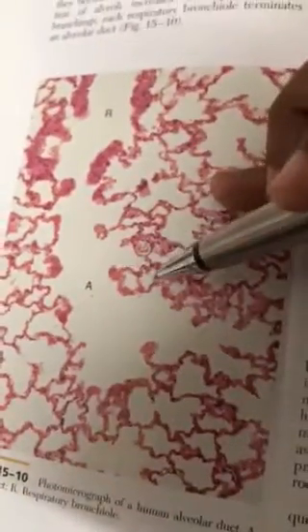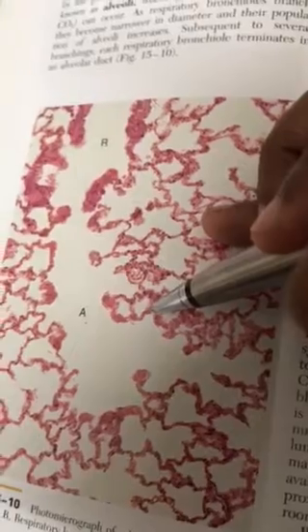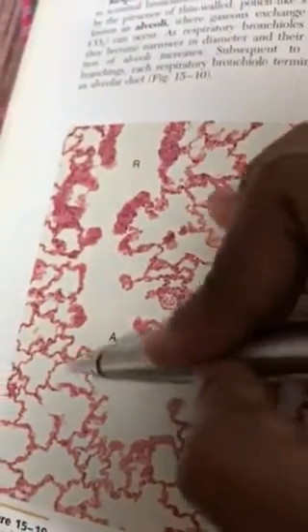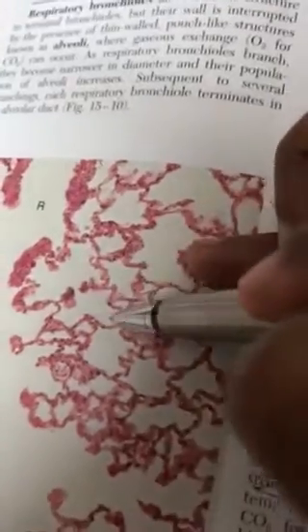Here is the slide of the lung and trachea. We are in the respiratory system. We do have only 2 slides. Slide number 1 is here. You can see the nice alveoli. This is your lung. So these are all alveoli.